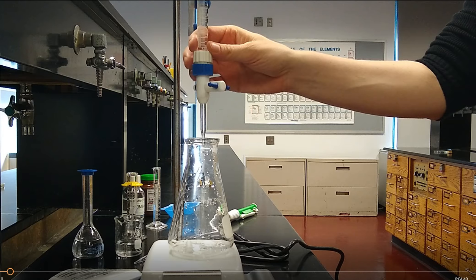The liquid that goes inside the burette, specifically the solution, is called the titrant. For our lab the titrant is going to be the same for all titrations we run. It's going to be sodium thiosulfate, Na2S2O3, aqueous.